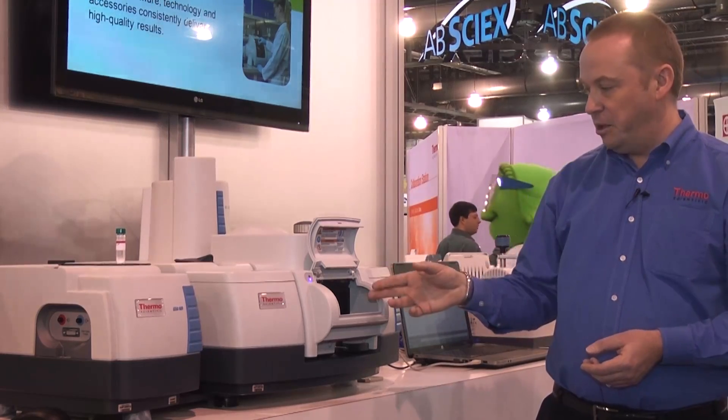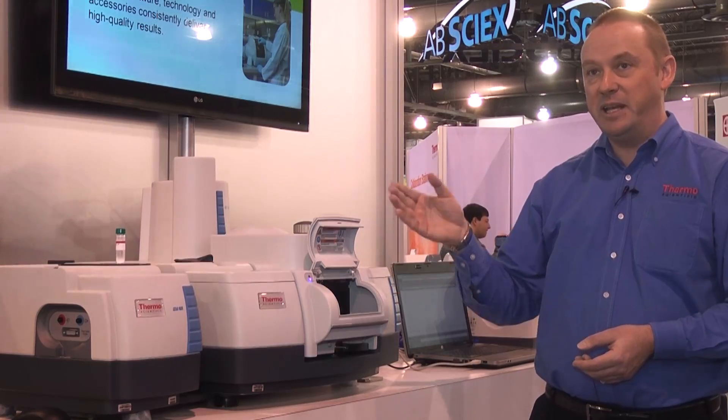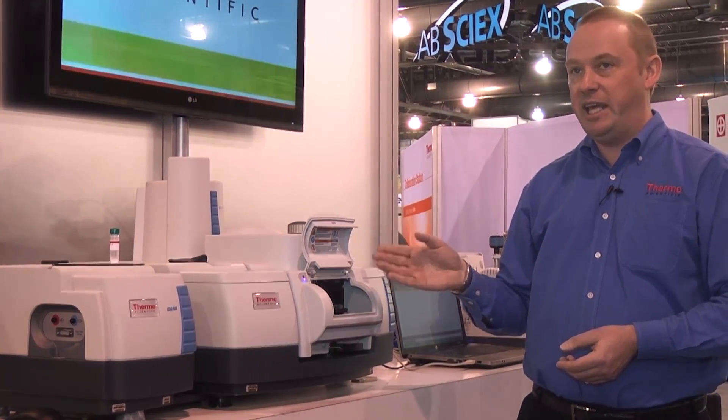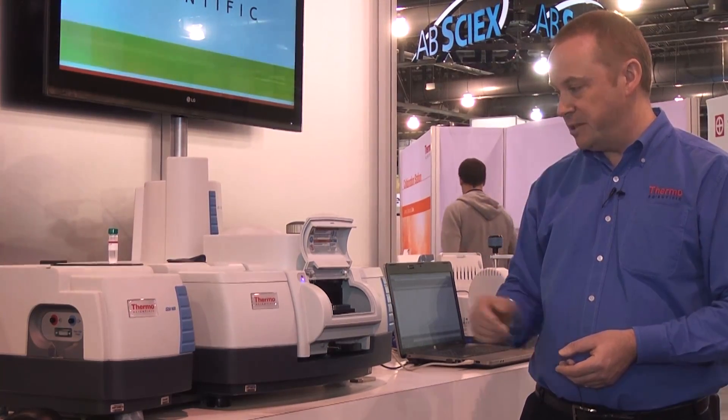There's a nice little video camera that points down at the sample so you can see the sample that the Raman laser is pointing at, making it extremely easy to locate the sample and obtain a very good Raman spectrum of it.